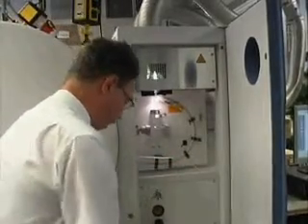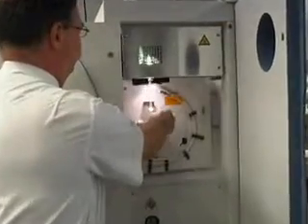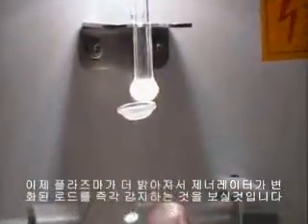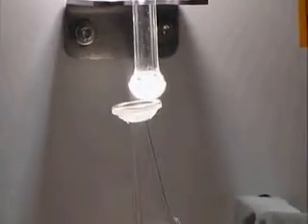We open the cover, disconnecting the spray chamber. And we see the plasma gets brighter, showing the generator adapting instantaneously to the change in load, and we also see the aerosol that's coming out of the spray chamber.